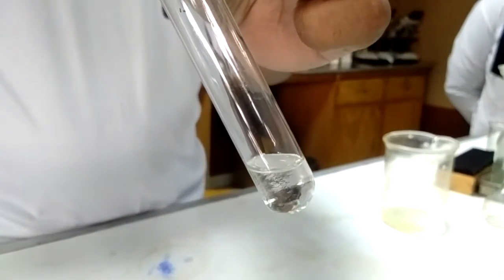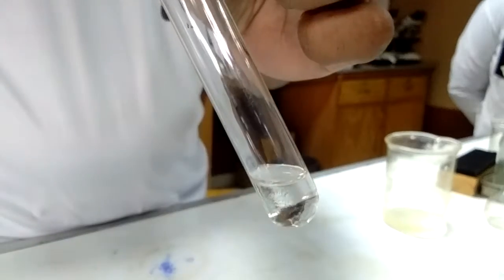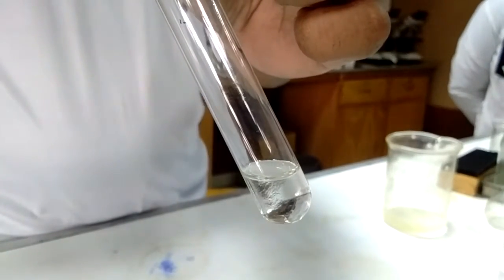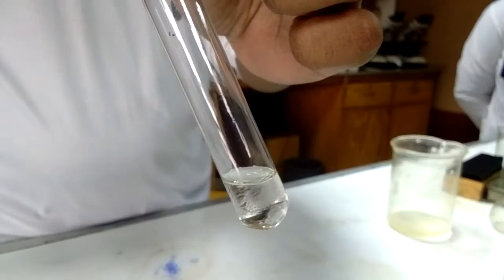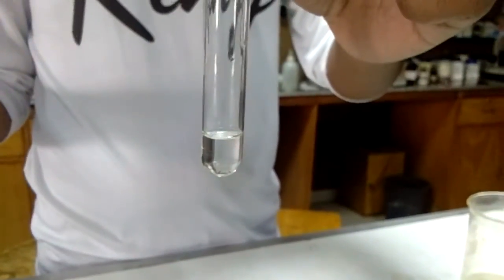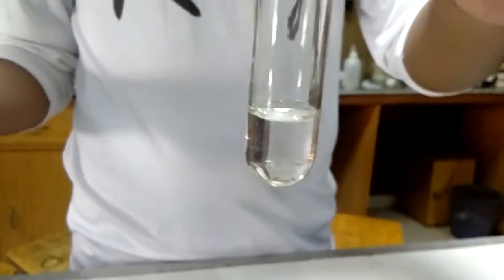You can see that after adding the acid, there is concentrated sulfuric acid. Clearly, there are two layers - one layer above and another below in the test tube.